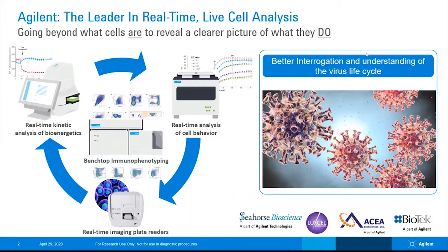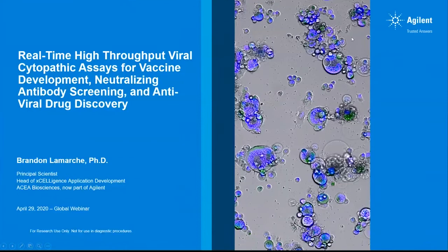Thanks, Yama. So I'm going to be talking about real-time high-throughput viral cytopathic assays that can be used for vaccine development, neutralizing antibody screening, and antiviral drug discovery.